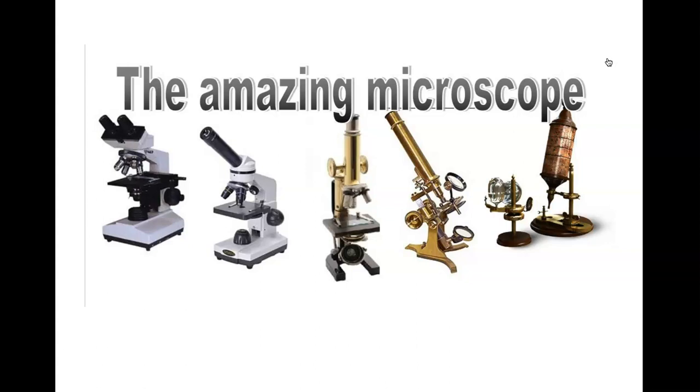All right. Microscopes have changed drastically over time. Robert Hooke was the very first individual that we recognize as using a microscope. He created his own microscope that then allowed him to identify cells. He was actually the first person to call cells cells. He thought that they looked like little rooms of a larger house.